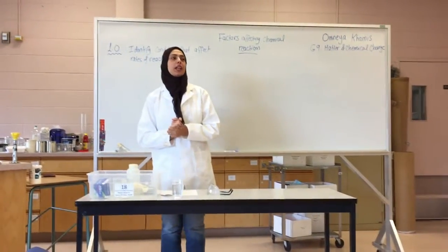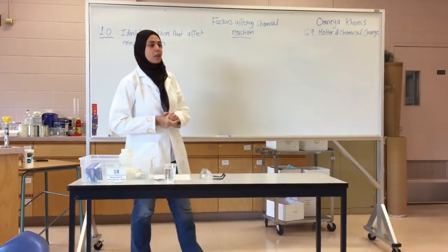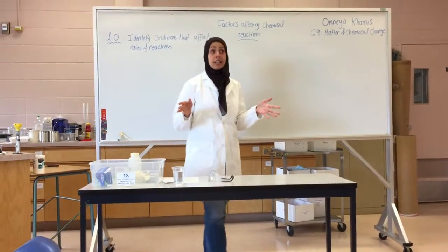Everyone, today we are working on Unit B, Matter and Chemical Changes, and the topic for today's lesson is factors affecting chemical changes. So apparently today we are in the lab.